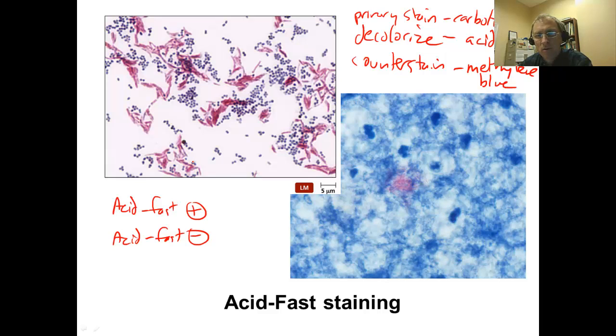When the microbiology student hears about the acid-fast bacteria, they're really talking about one small class of bacteria. These are going to be gram-positive bacteria. But when we stain them with the Gram stain, these hot pink cells, if these were stained with the Gram staining procedure, what you would actually see is that they don't get stained positive or negative at all. They're gram-positive bacteria in that they have a thick layer of peptidoglycan, but they also have an added chemical called mycolic acid in their cell walls, and this addition of mycolic acid makes it extremely difficult for the Gram stain reagents to get inside these cells.